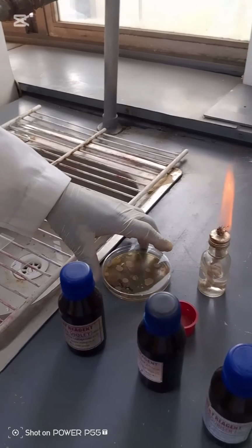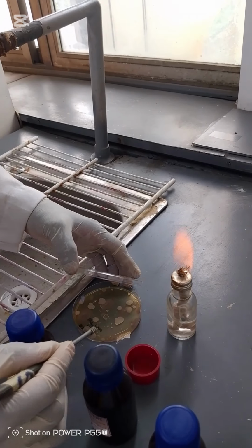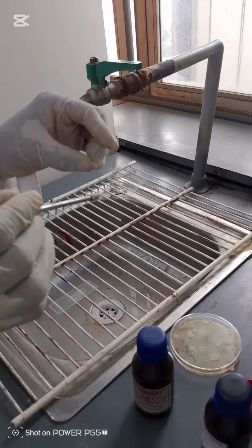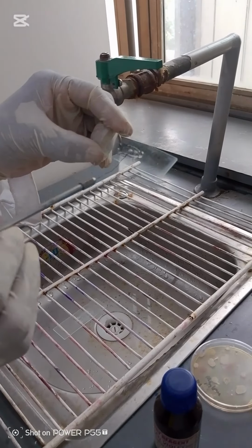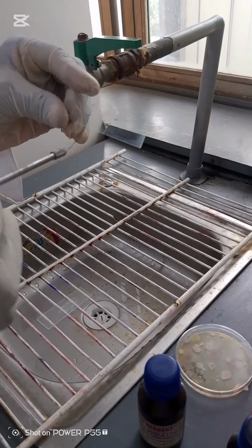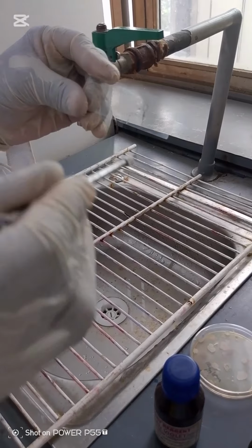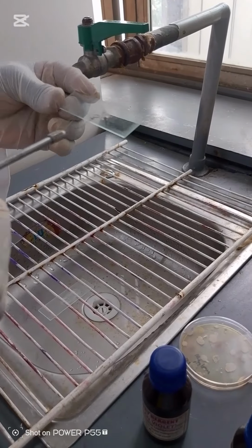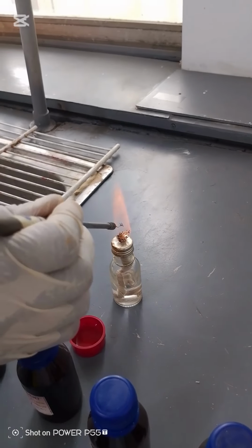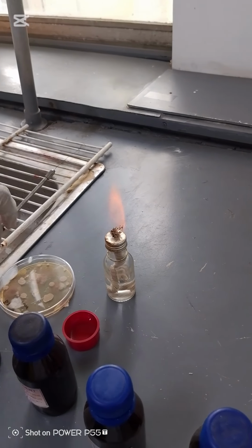We repeat the same thing. You flame, you cool, then you pick a small aliquot of the bacterial cell and you make a smear. You emulsify the bacterial cell with the sterile water to make a smear, spreading it evenly so you can have an even distribution. Each time after using your inoculating loop, you always sterilize it until it's red hot, before you pick the bacterial cell again.